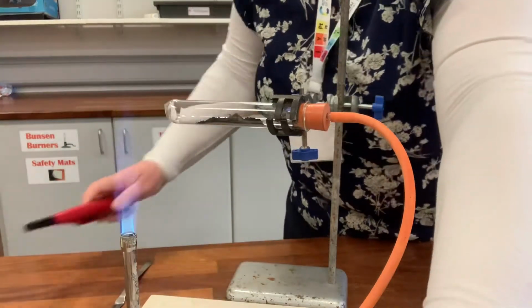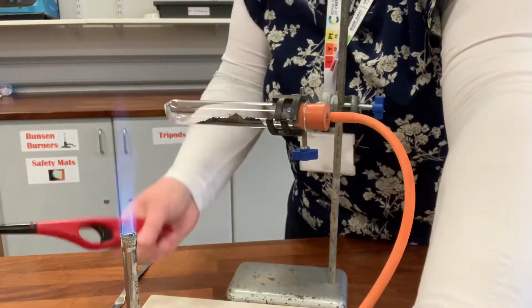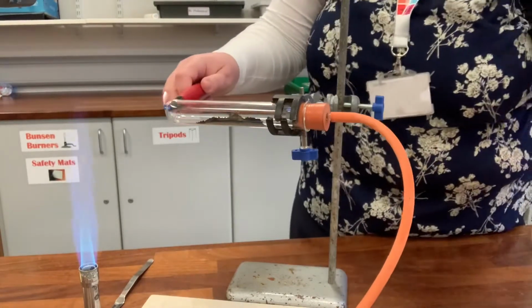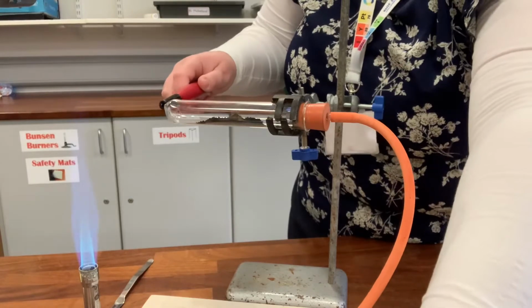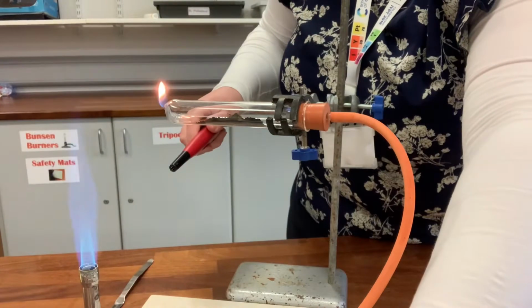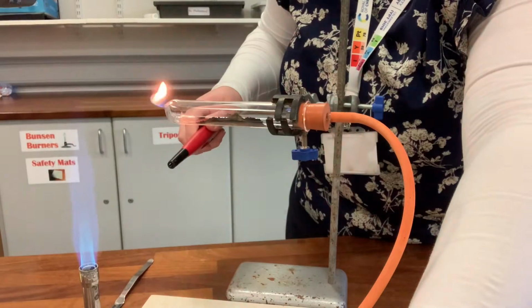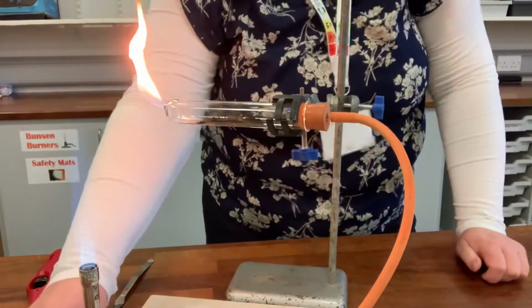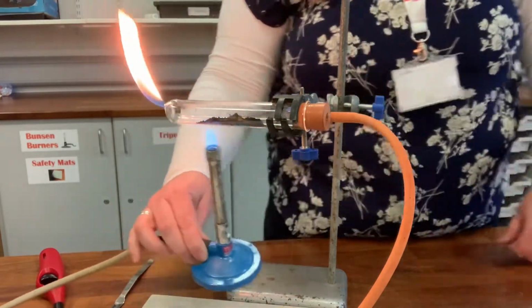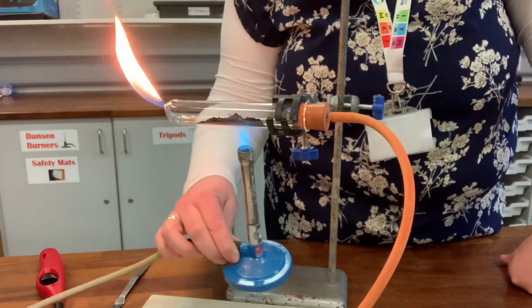So I'm just going to turn the gas on. The gas comes up through the gas tube and along through the tube. And we're able to light a flame at the end of it here just to show that the gas is going through the tube. And then I just turn the gas flame down so we have a smaller flame that we can see, so it should stay lit during the experiment. And then I'm going to use the other Bunsen burner to just gently heat the copper oxide inside the tube. So watch out for signs that a reaction's happening, see if you can spot some signs.